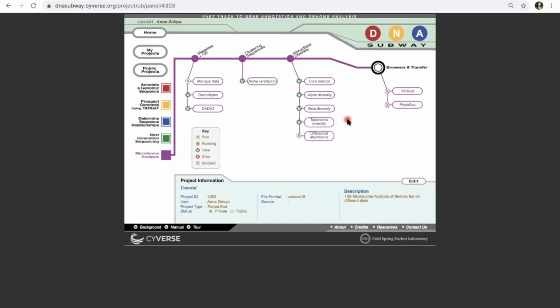And now we're coming towards the end of our analysis. There's not anything really here to view at this point. I mean, there are things that you can view, but it's nothing that we really need to finish things up. Here at Alpha Diversity and Beta Diversity, these two tabs do have some good information, but you're going to do these steps later in a tutorial with another online teaching tool. What we're going to do instead is go to this taxonomic diversity tab.